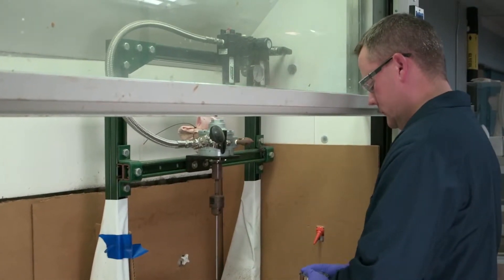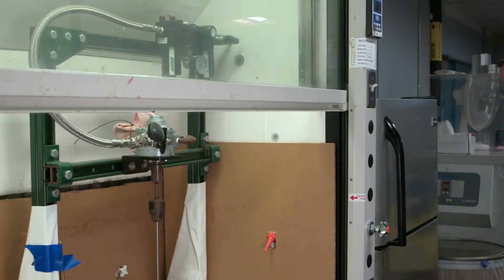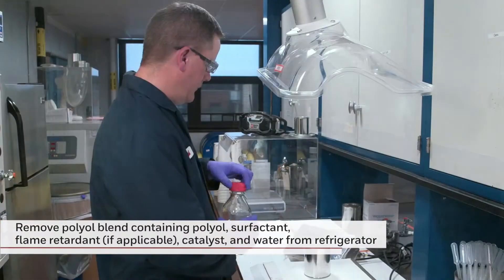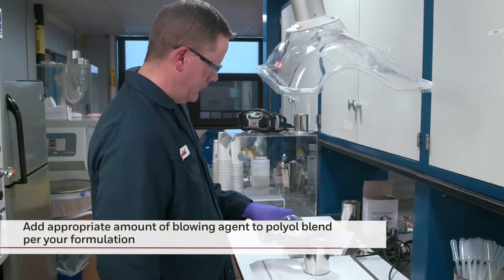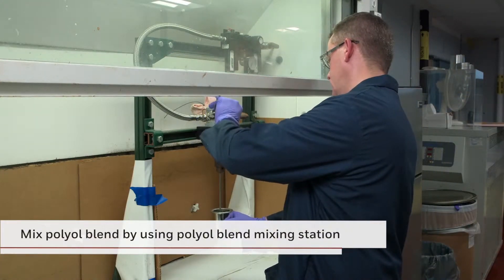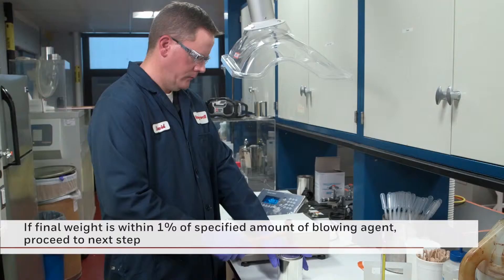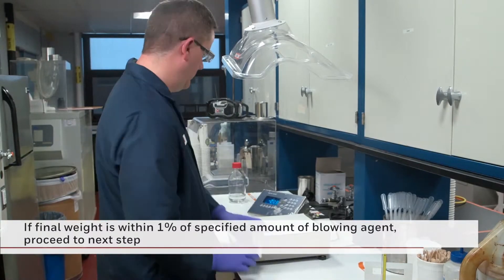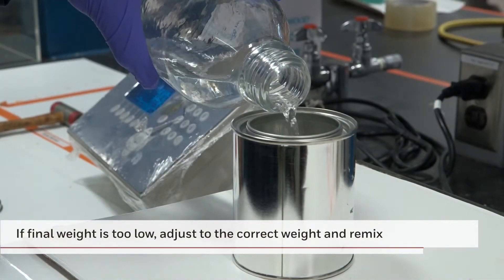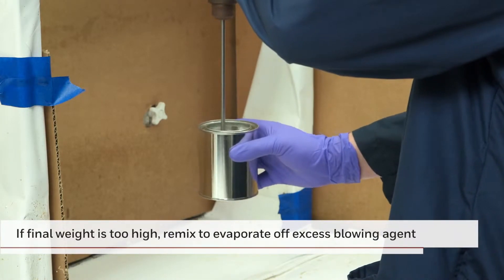After blending is complete, the polyol blend is placed in the refrigerator and chilled to 50 degrees Fahrenheit or 10 degrees Celsius, or your preferred processing temperature. For this video, we will process at 50 degrees Fahrenheit. Once the polyol blend has reached 50 degrees Fahrenheit, it is removed from the refrigerator. The container is tared and the appropriate amount of blowing agent is added depending on your formulation. The polyol premix is then blended; the agitation is started slowly to eliminate splatter. After mixing is complete, the polyol blend is re-weighed. If the final weight is within 1% of the specified amount of blowing agent, the polyol blend is covered and returned to the refrigerator to bring the temperature back to 50 degrees Fahrenheit before the foam is made. If the weight is too low, additional blowing agent is added and the polyol blend is mixed again. If the weight is too high, the polyol blend is mixed longer to evaporate off some of the blowing agent and then re-weighed.